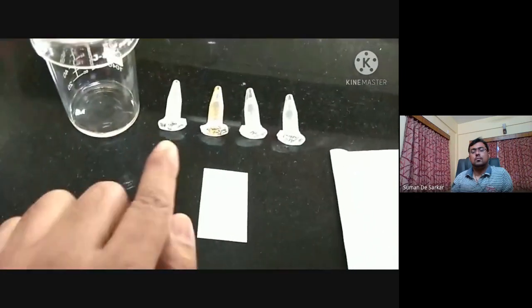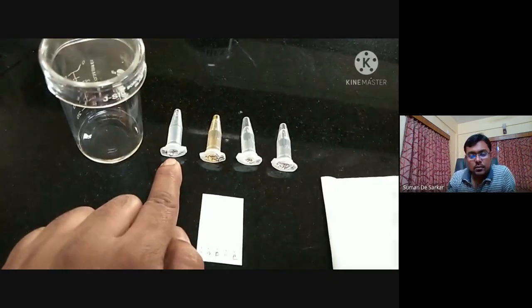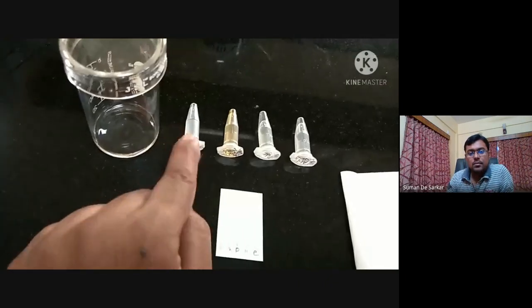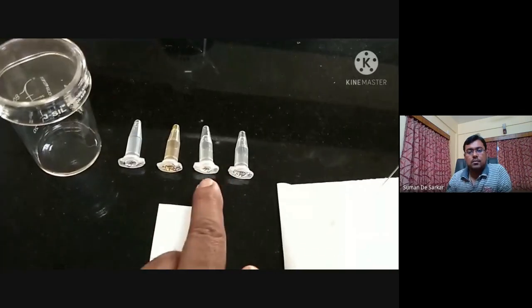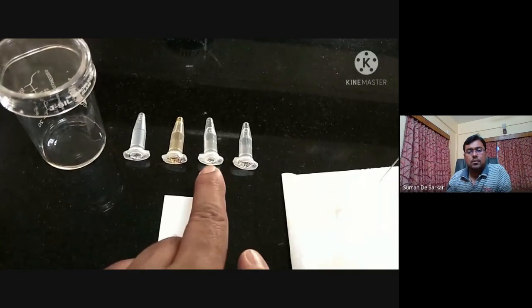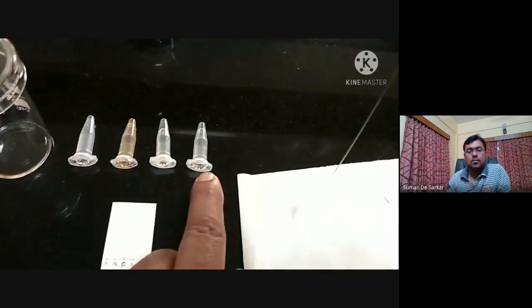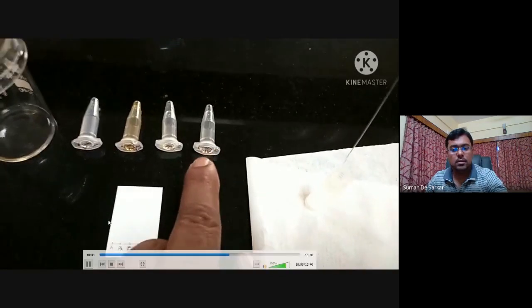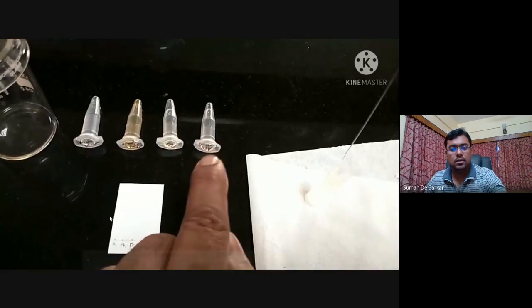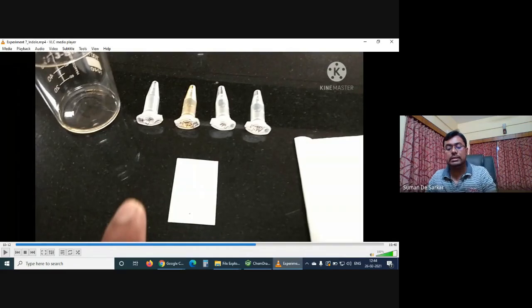And as we have already explained separately, we need to spot the reactants also. This is a solution of acetophenone, the solution of phenyl hydrazine. This is the final reaction mixture product where we expect to have this indole product, and here is the phenyl hydrazone, the intermediate product of the last step. Actually, I will pause here, and then I forgot to mention about the TLC.